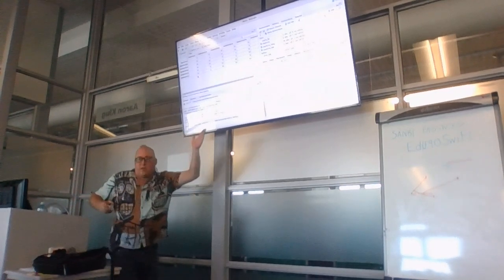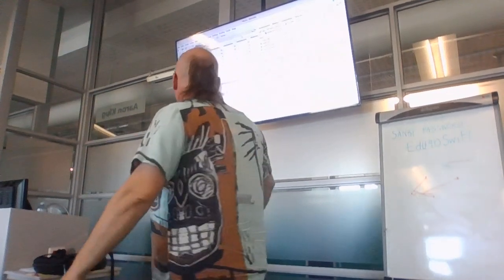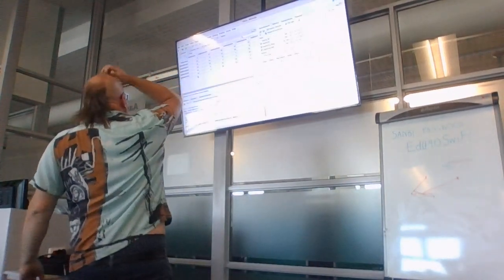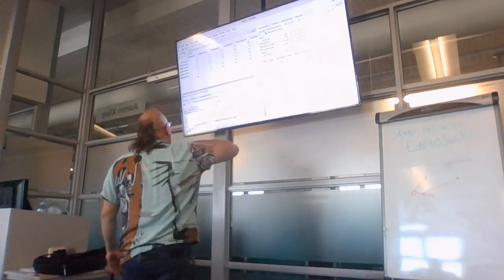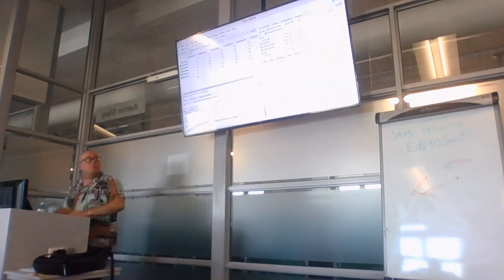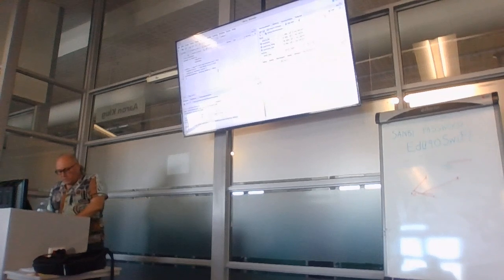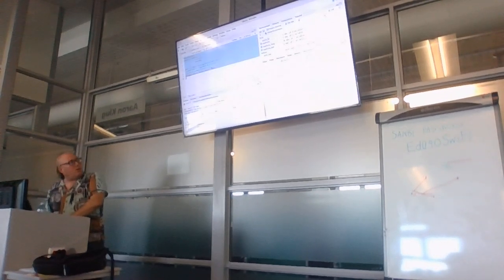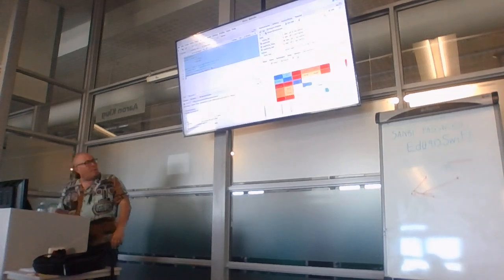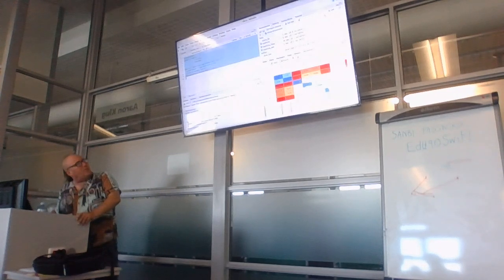So immediately this is already easier to read. You could load it into Excel or LibreOffice Calc as well, but we can now see, yes, 370 to 253 is 8, okay? But let's make it visual. So once I've got this matrix, I'll just run all of this code all at once. I can use pHeatMap to plot a heat map and put the numbers in place as well.